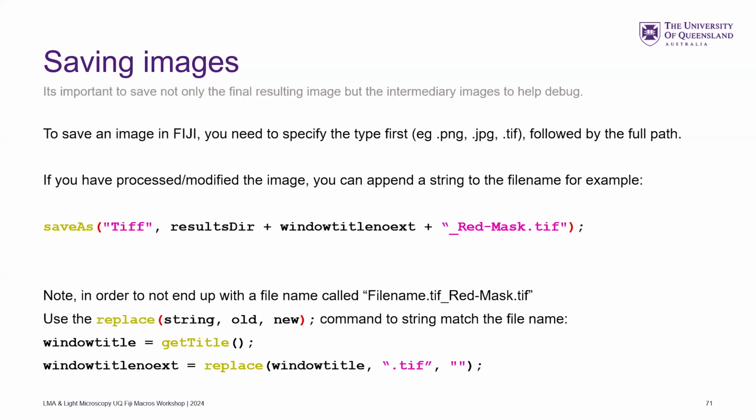And so this will iterate over each image, because earlier in the script we would have had what the file name is, but this suffix will stay static. So if you have like 3 images, image 1, you'll get an output called image 1 underscore red mask, image 2 underscore red mask.